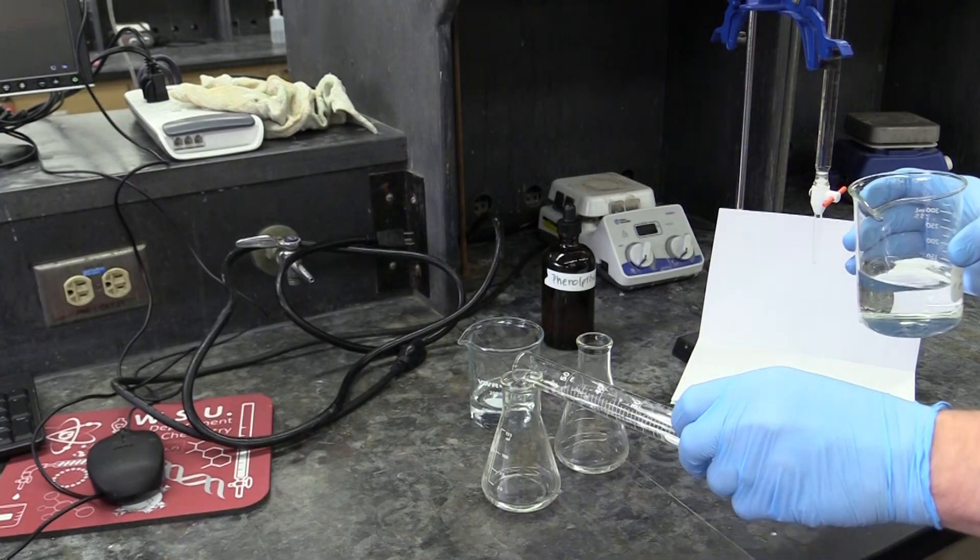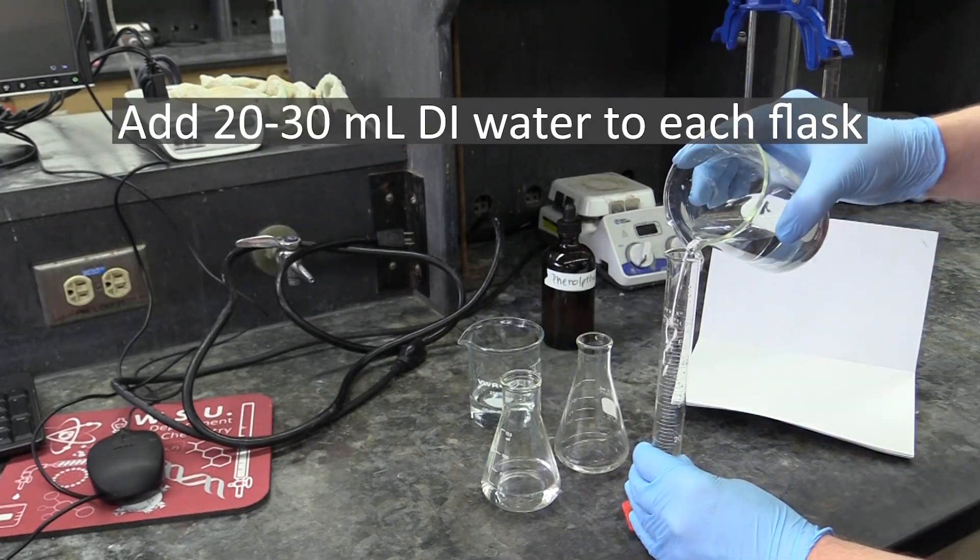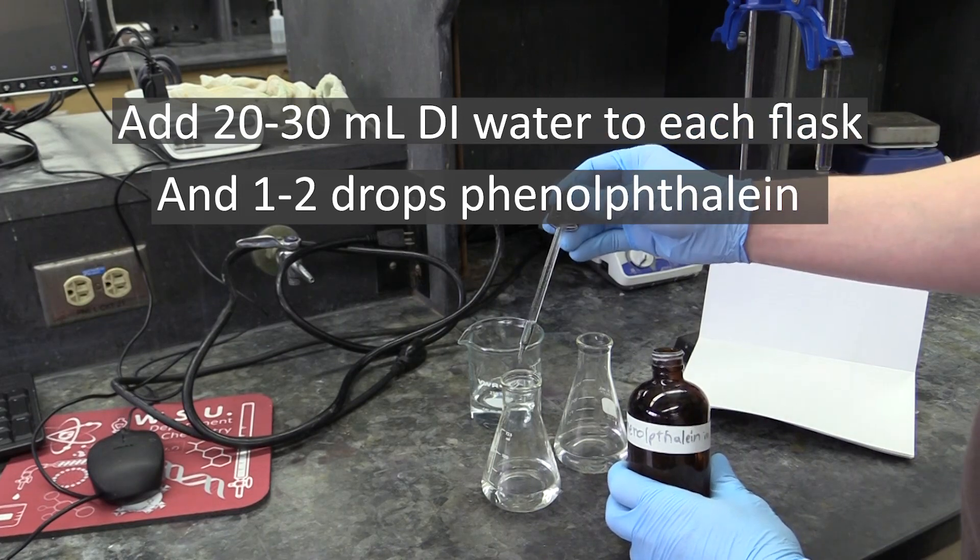Finish setting your flasks up by adding 20-30 ml of DI water to each one, and one or two drops of phenolphthalein indicator.